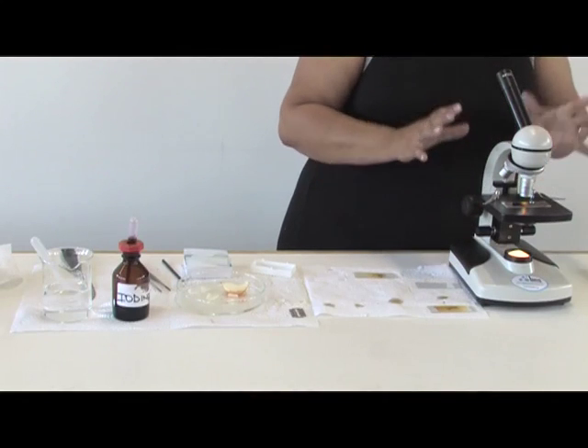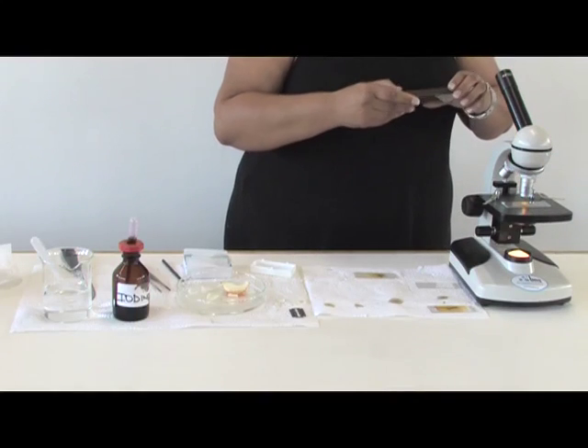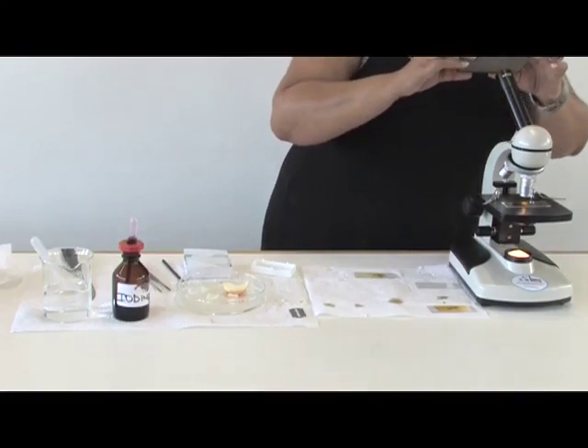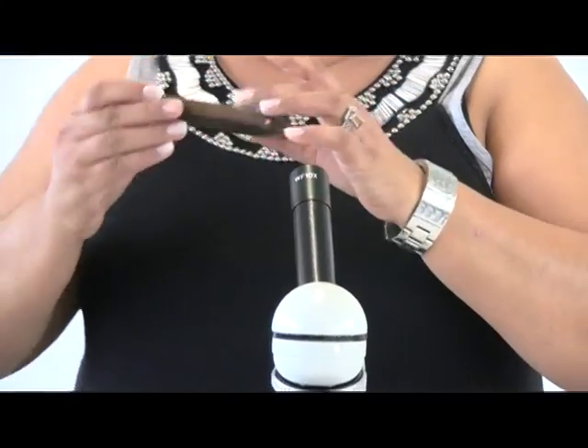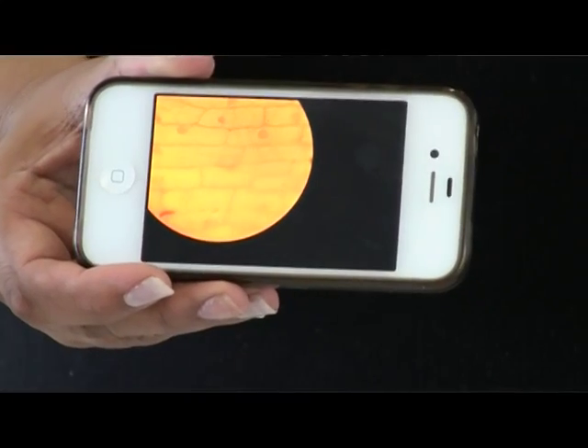After focusing, if you don't have a lot of apparatus, you can take your cell phone and take a photo of what you see. Once you have the image, you can project it — and this is what can be seen under the microscope.